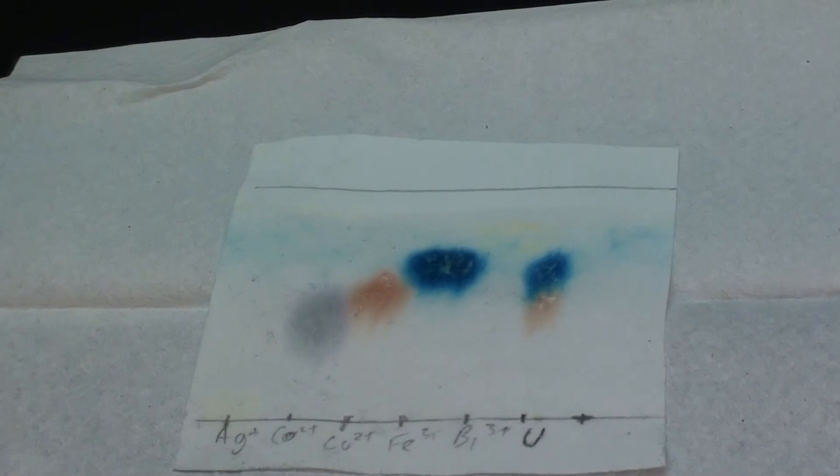And as you can see some of the things turn different colours from what they were. And it's going to be important for you then to write down those colours after staining as well. So there were colours before on some of them and then there were colours afterwards on some of them. And this will help you to identify your unknown as well.